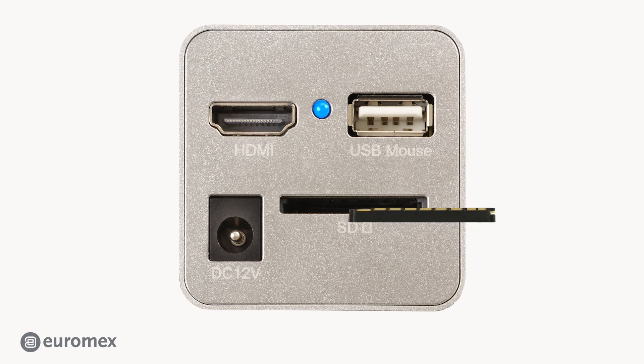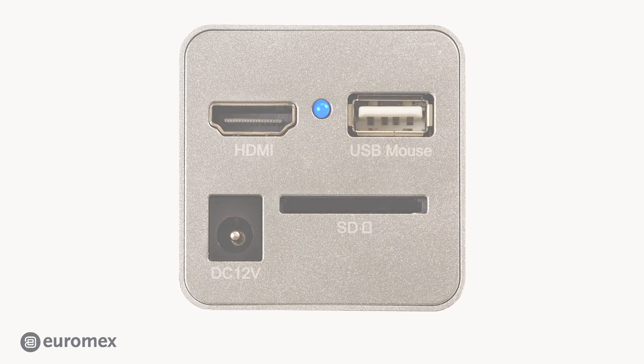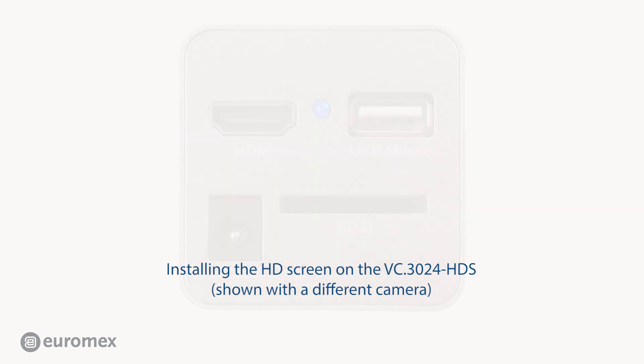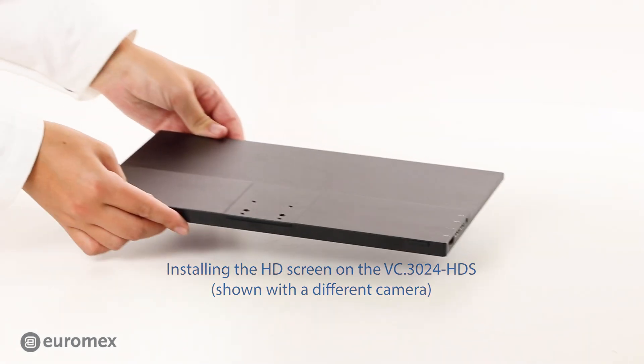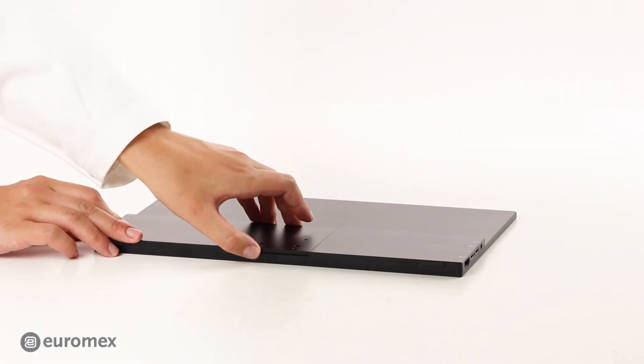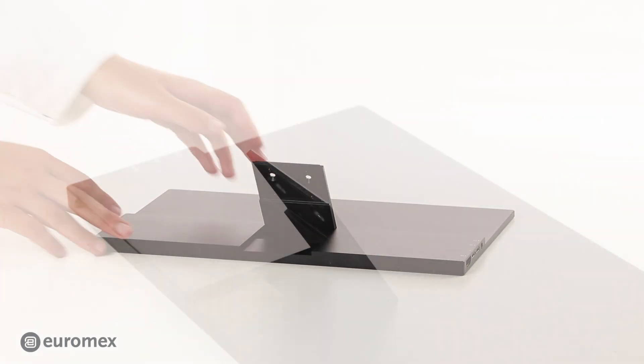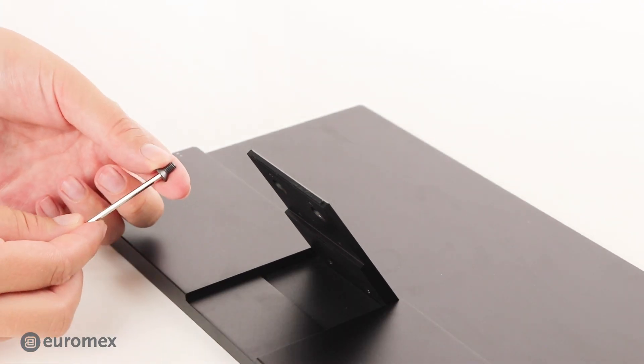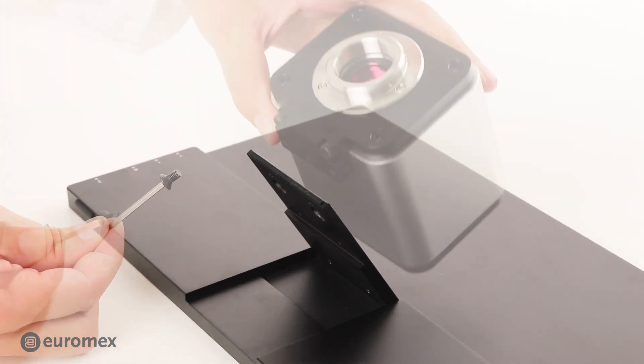Insert the SD card as indicated. Newer models are equipped with a USB flash drive instead of an SD card. Use the two Allen screws to attach the camera to the screen.